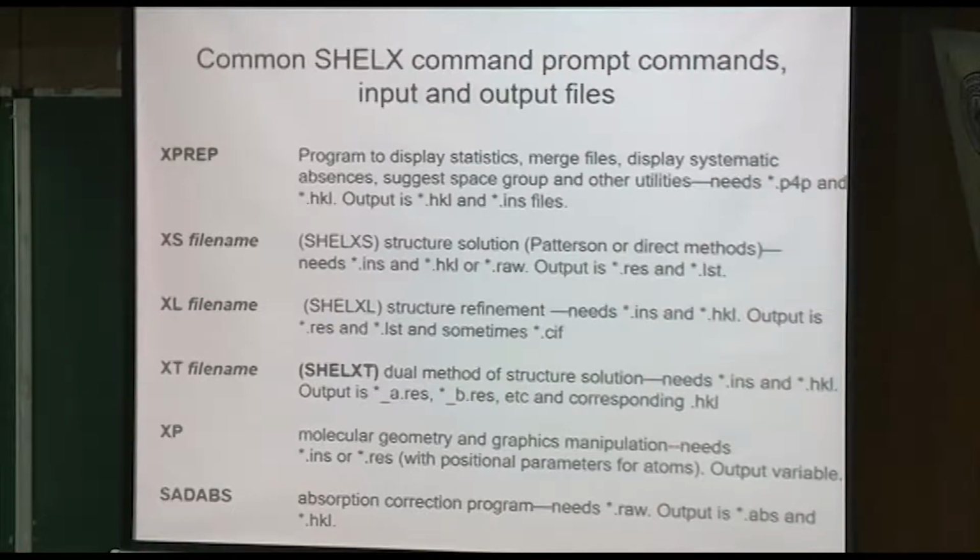So it's extremely sophisticated. It also suggests optional space groups that are similar to the one that you would most expect. For example, P21 over C, it will select that one. It will also select maybe P21, PC, P2. So lower symmetry versions of that same space group will be output. Usually, though, it's the first one that comes out, the underline A, that's the correct one. But sometimes it's the other ones. Rarely, but sometimes. Anyway, I'll give you an example of that.